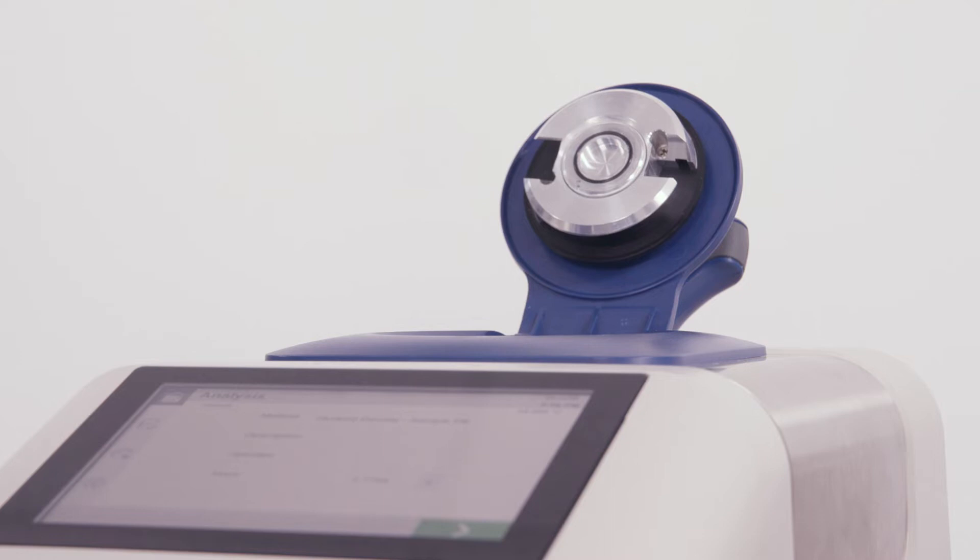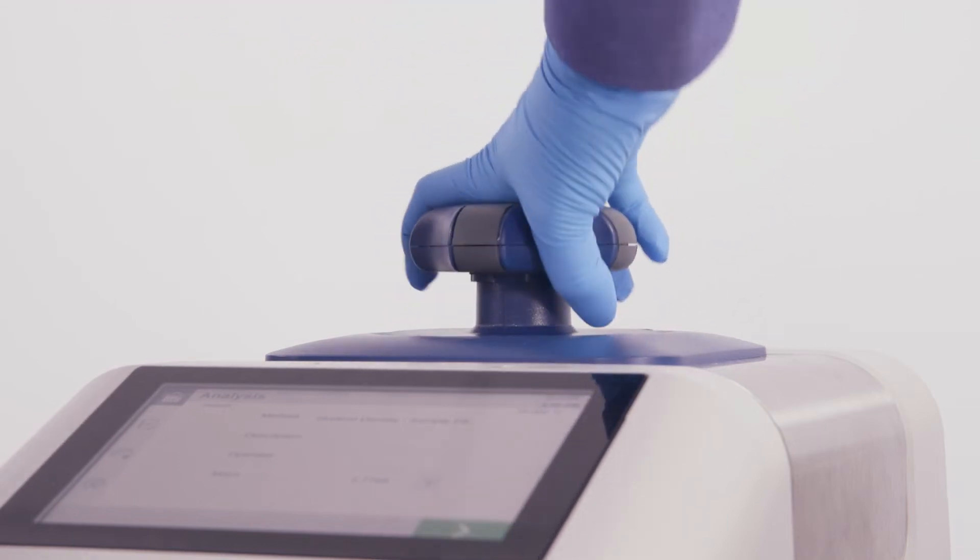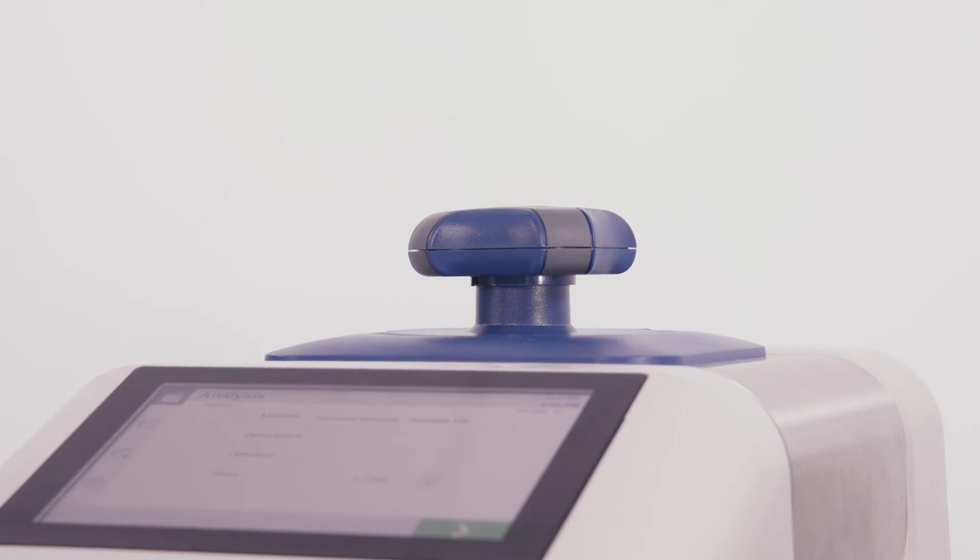The AccuPIC has a hinged self-aligning lid so you can never lose the lid, and it locks into place at the same tightness every time, eliminating operator influence.